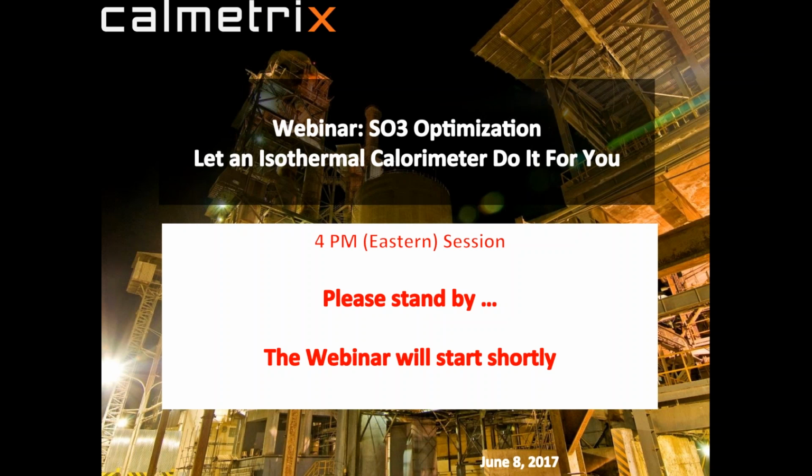And sulfate balance is traditionally something that cement suppliers, if you ask them, they have slightly different answers as to how they do it and why they do it and what the ultimate purpose is. But eventually it boils down, I think, to a trade-off of what you want your cement quality to be. It's of course a trade-off as usual between economics and performance. It's also a trade-off of what you want your cement to be in the marketplace.